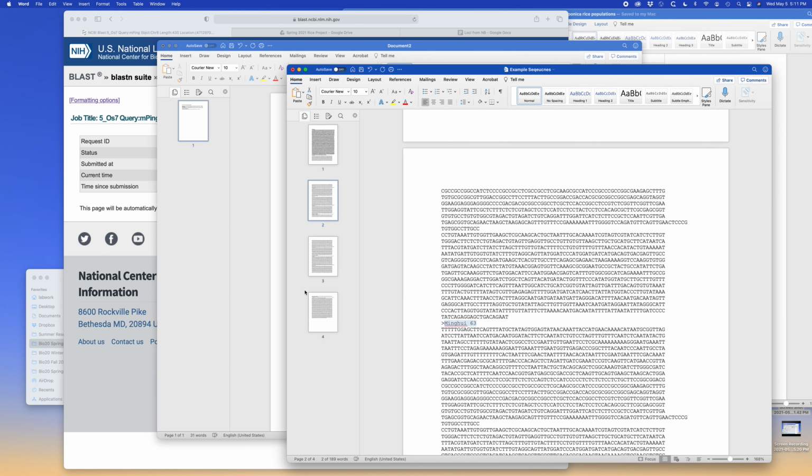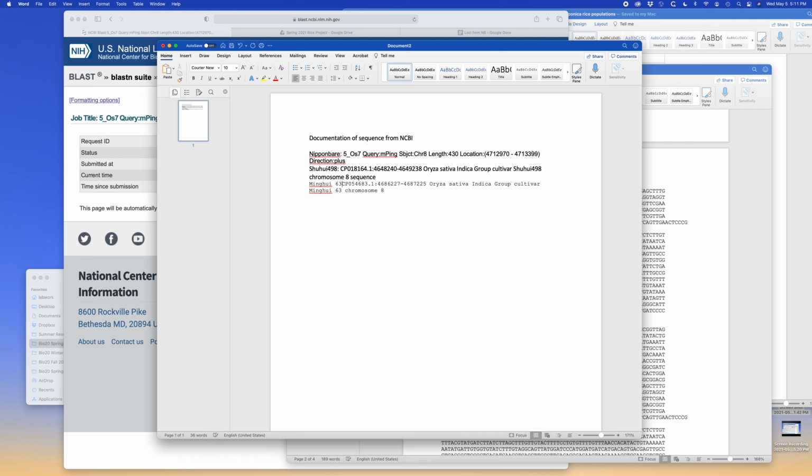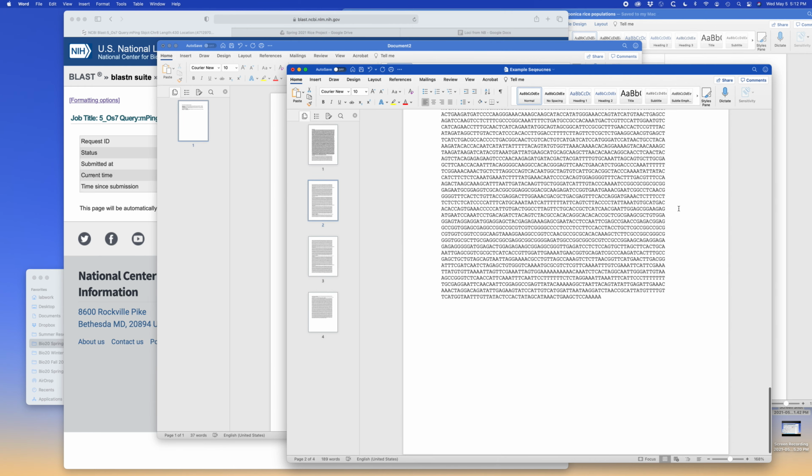So continue working on that. I'm going to pause the video again because there's no need to sit and wait for BLAST and watch me do this. I will pick it up after I've completed my FASTA file, and you can as well.